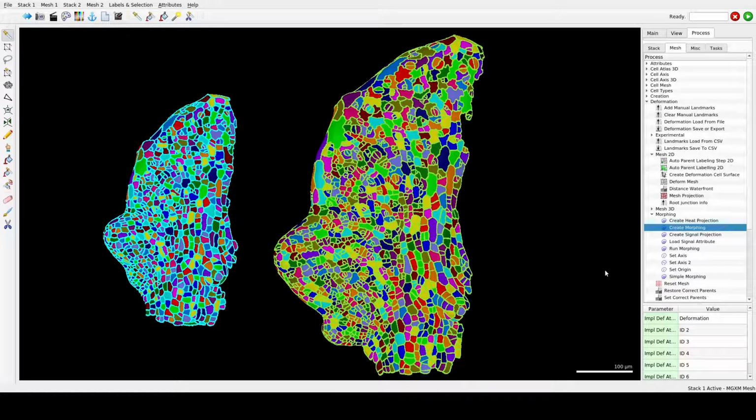If the two samples are too different in shape, it's good to run the process set origin to avoid translation and rotation problems by setting a few cells or vertices as origin that will not move. And remember that when you use more than two meshes, it's really preferable to manually orient and position each mesh and save them, checking transform in the saving dialog window.